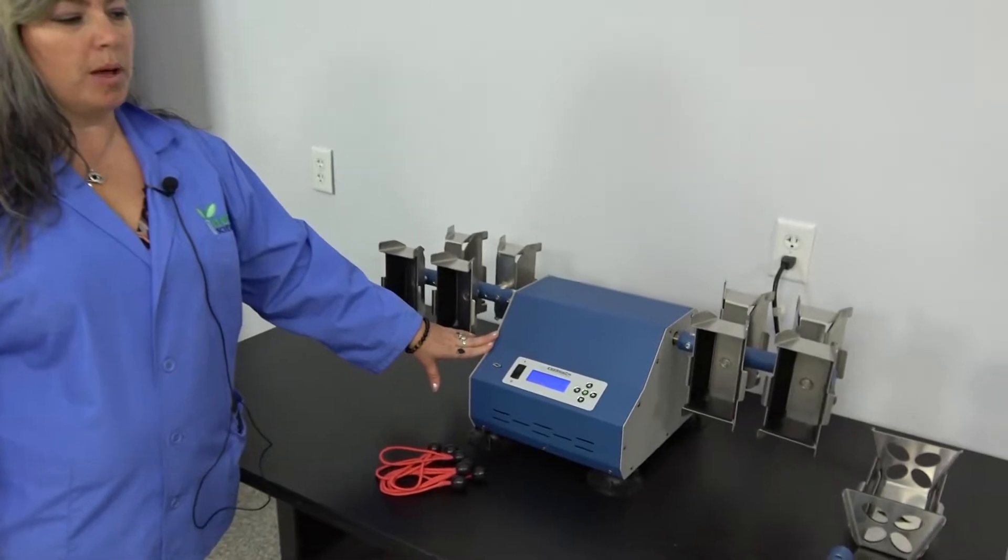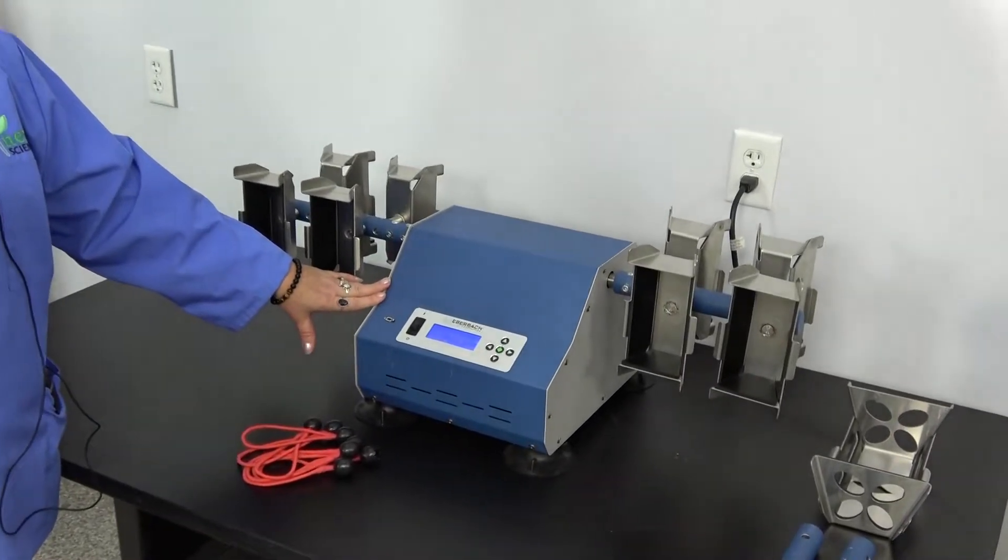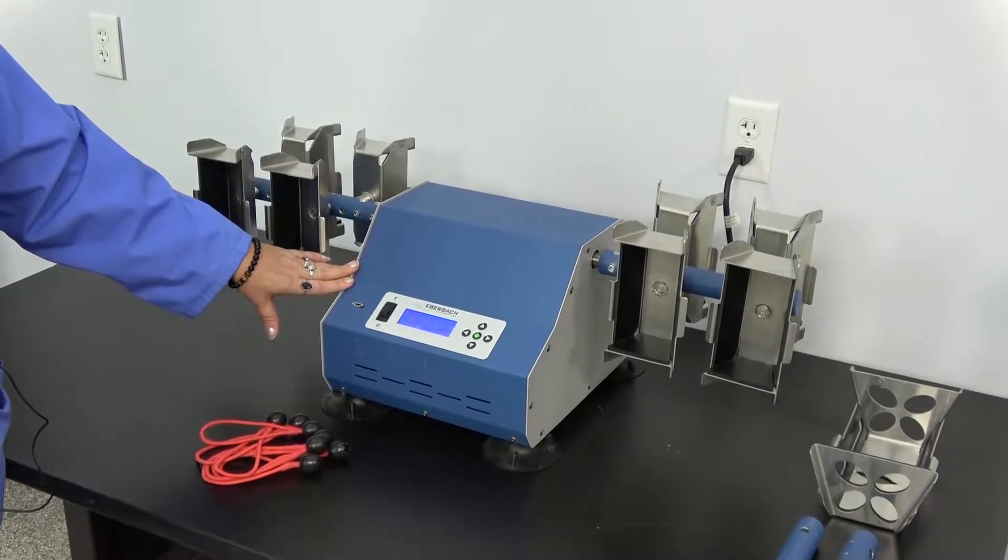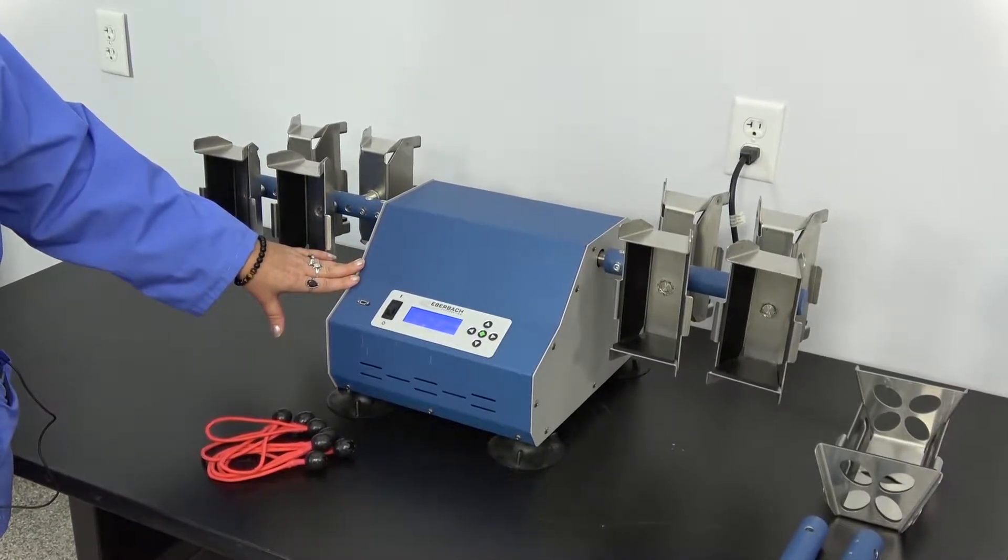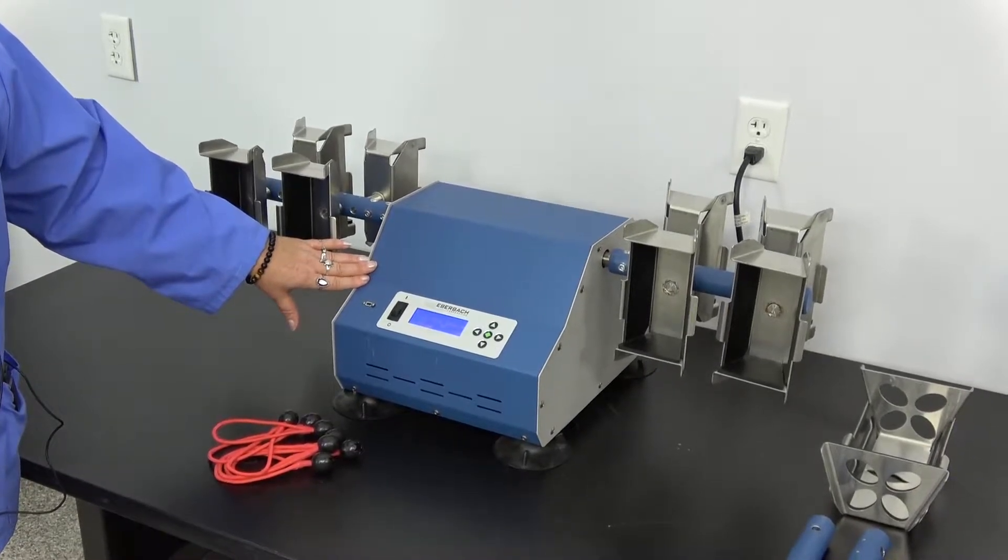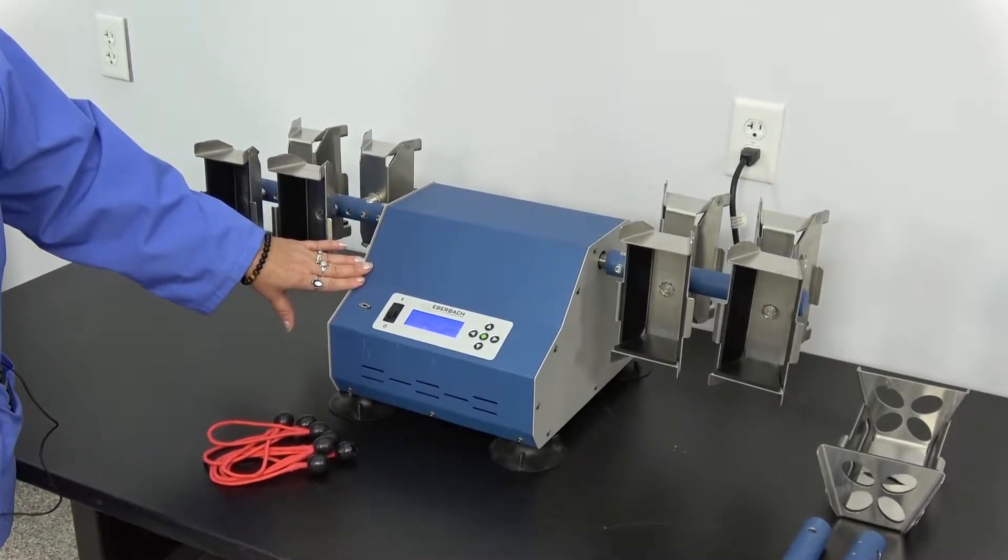This shaker, made by Eberbach, mimics the motion of hand mixing. It can be used for extractions, dissolutions, and emulsifications. This makes the EL680 a great addition for research labs with medium to high throughput of samples.